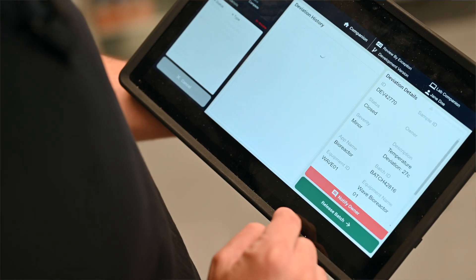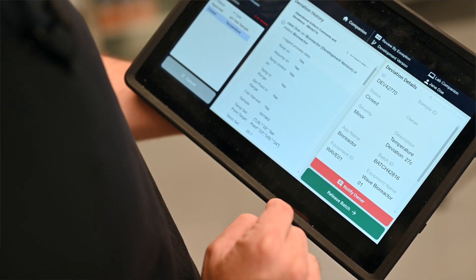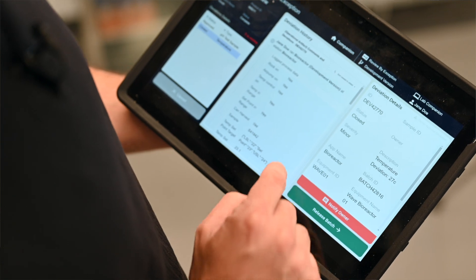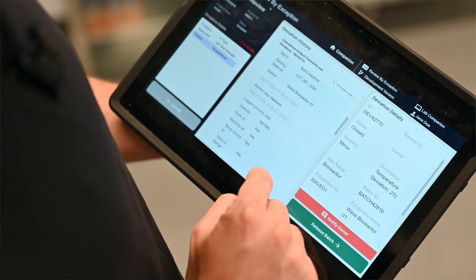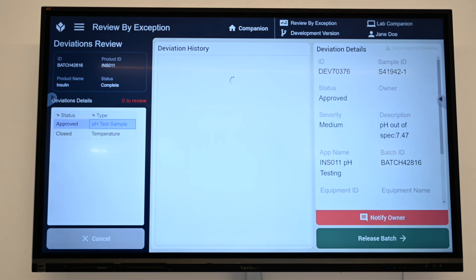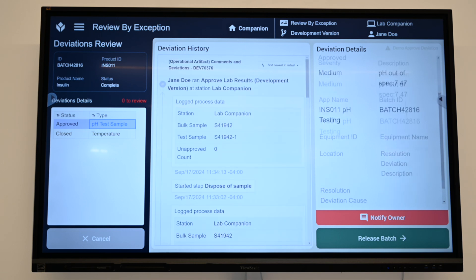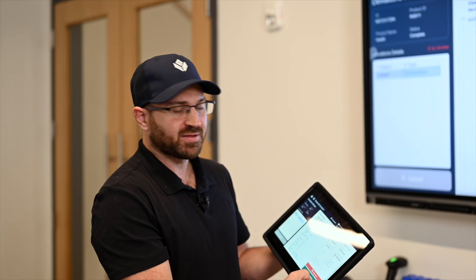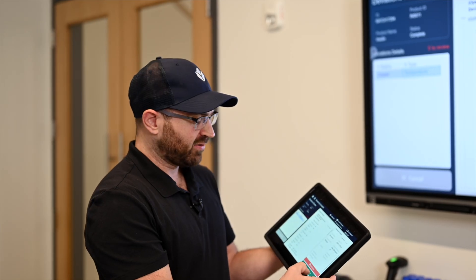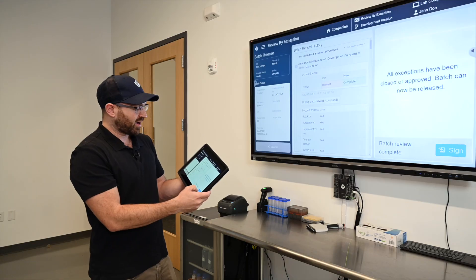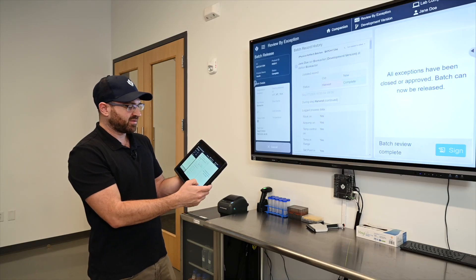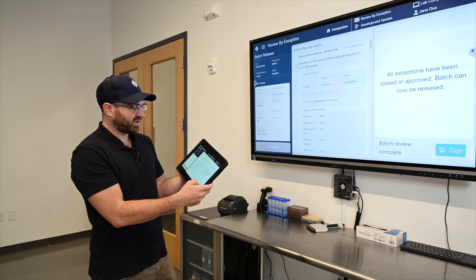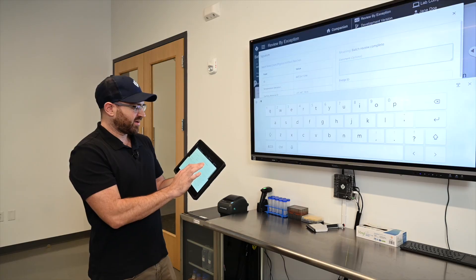So I'm going to view those. I can select them and see what created this, how long it lasted, whether it was a minor, major, or otherwise type of deviation. I could notify the owner and then I could choose to release the batch. So I'm going to release this batch here and I'll sign off on this. So all exceptions have been closed or approved. I can now release this and I'll sign off.